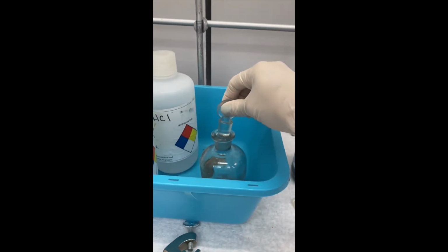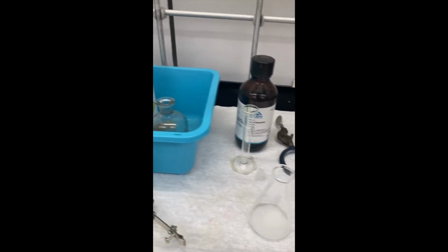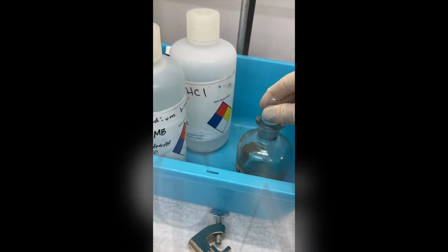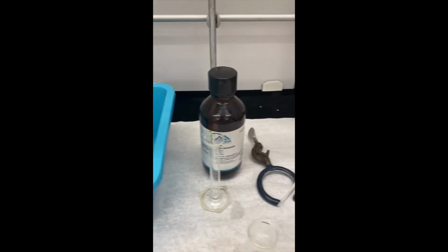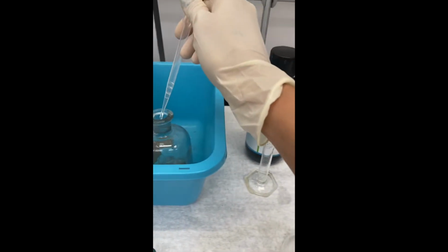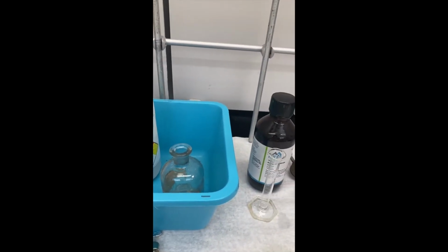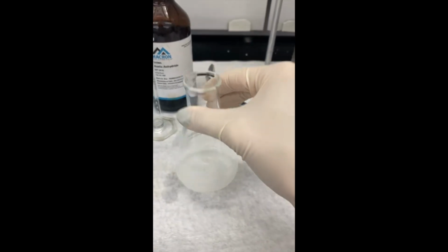And the last step is to add a few drops because this is acid catalyzed. We're going to add about 3 to 4 drops of sulfuric acid. And this is concentrated, so I've got it in this bucket here. We don't need a lot, right? If it's catalytic, that means it's going to turn over in the reaction, and we just need a few drops of it to get that reaction to go. Set that aside, and I'm just going to give this another little swirl here.